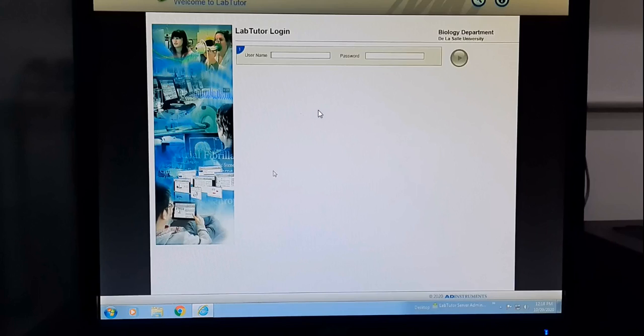As I mentioned before, we used to have LabChart. The advantage of LabChart, the one that we used before, is that you can actually tweak the stimulation parameters such as voltage, amplitude, frequency, etc. So if you're conducting a research, you can easily modify the parameters that you need to meet the conditions that you wish to study. But then the disadvantage of LabChart is that you need to also tweak the very same thing.